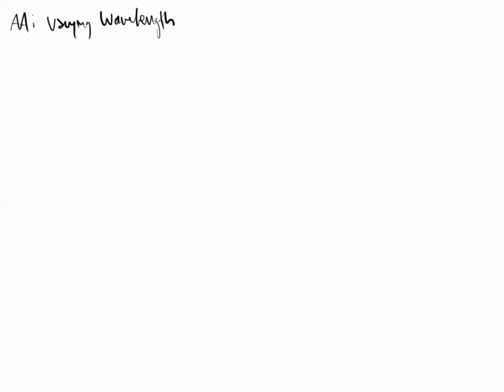Atomic absorption. What is it? What does it do? And why should I use it? The problem with this lab block is that many of you will start atomic absorption spectroscopy labs without first getting to atomic absorption spectroscopy in the classroom.